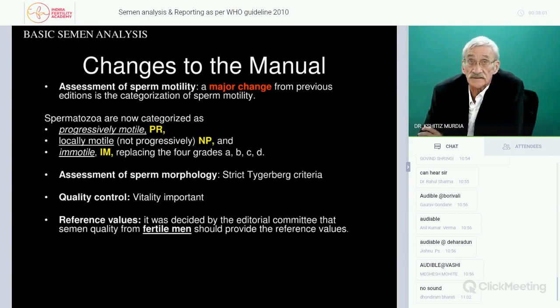So it's a very difficult technique to train the technicians to get a standard operating procedure that is repeatable and reliable and clinically significant. I mean, this is difficult. So the new method is more acceptable and easy to perform.